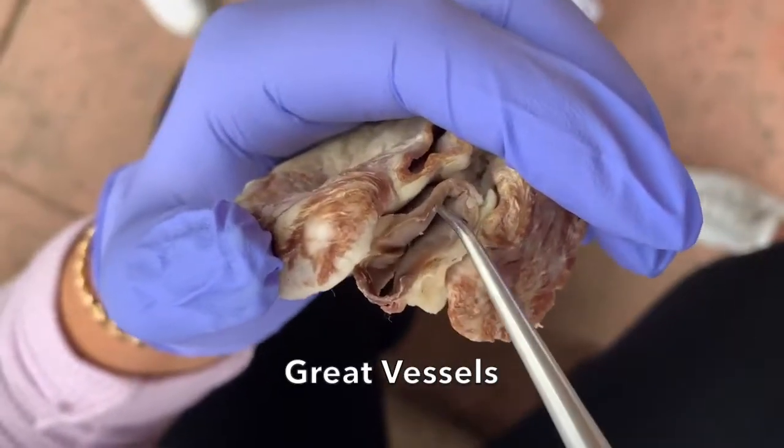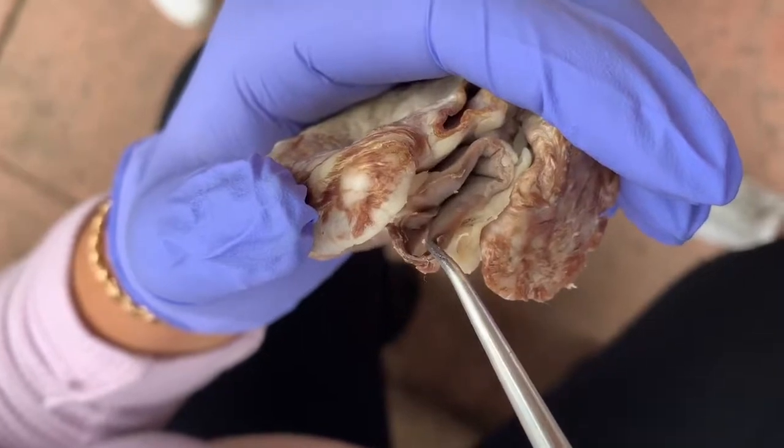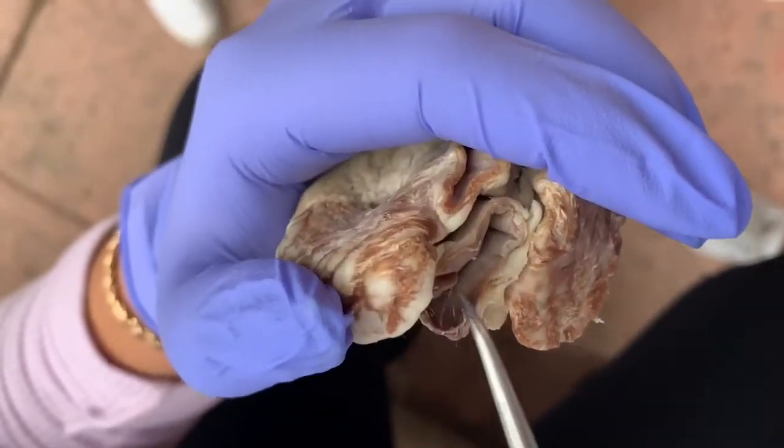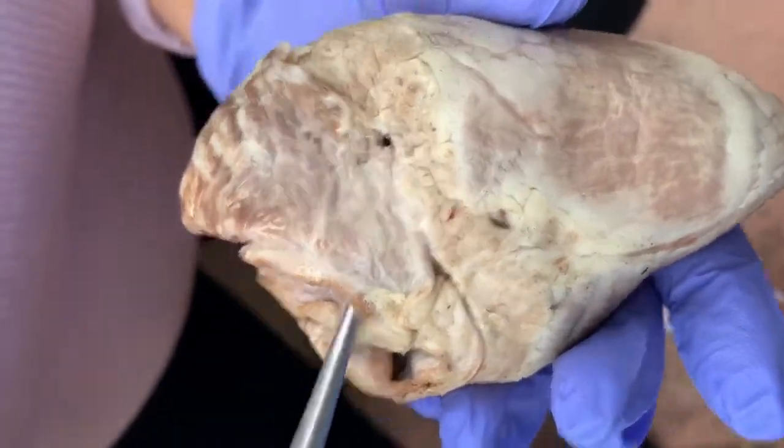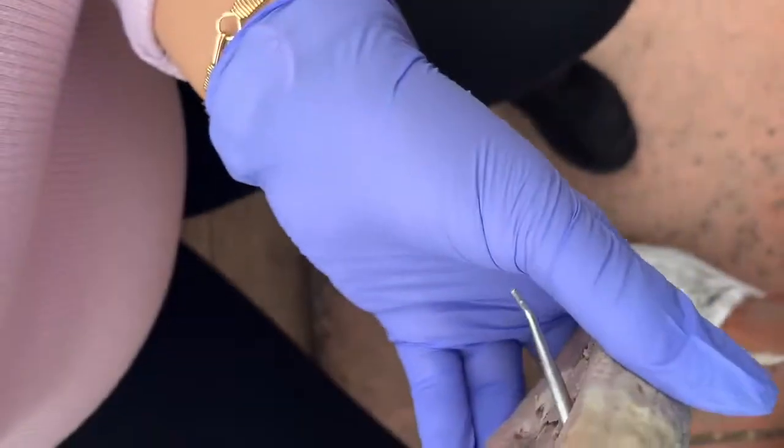So this is the aorta, and the brachiocephalic artery does branch off from the aorta around this area. This is a pulmonary artery, and this is the pulmonary vein.